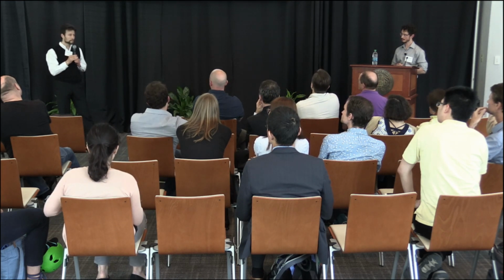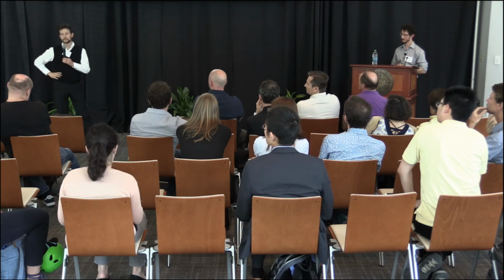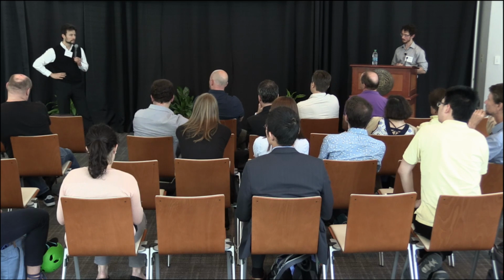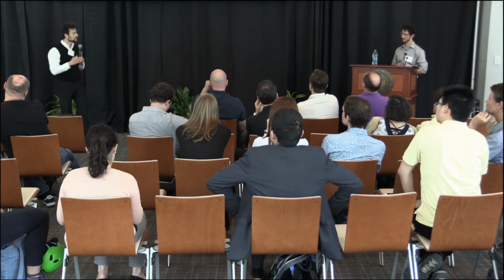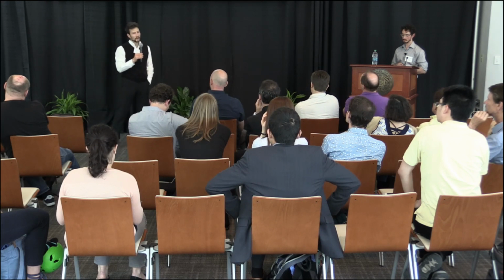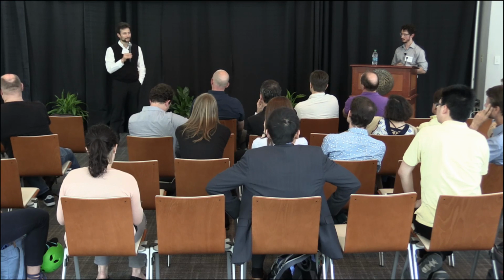at which point it might become important, as Paul is suggesting, to perhaps eliminate the freezing step or not freeze at -80. To the extent that we do the sorting in 96 well plates, it's incredibly easy to put a whole bunch of those in the freezer. It's not really adding much time to the protocol, but if we are doing this in a microfluidic device, it might be desirable to test how much further we can simplify what we have developed.